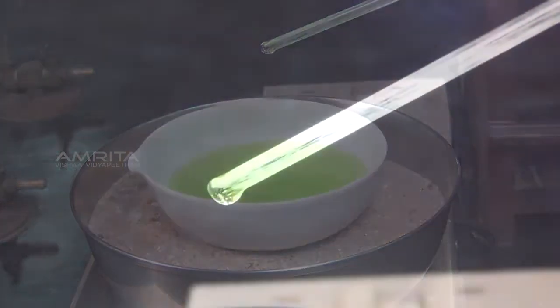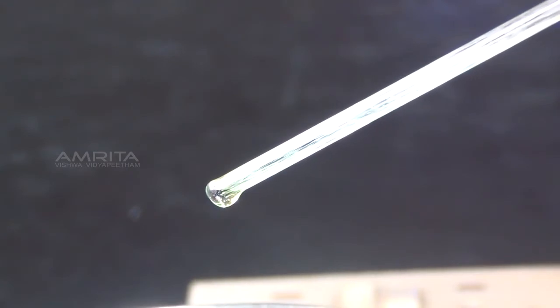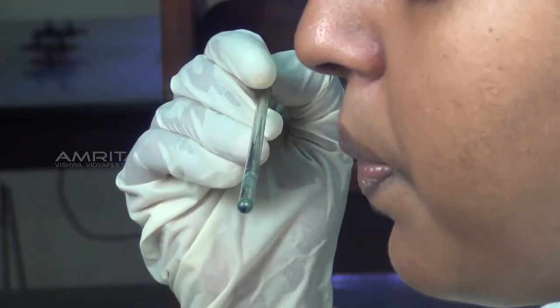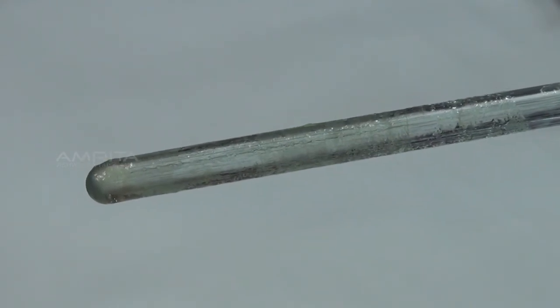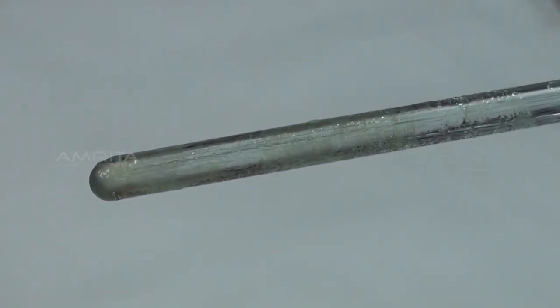Take out a drop of the concentrated solution at the end of the glass rod and cool it by blowing. Formation of thin crust indicates that crystallization point has been reached.